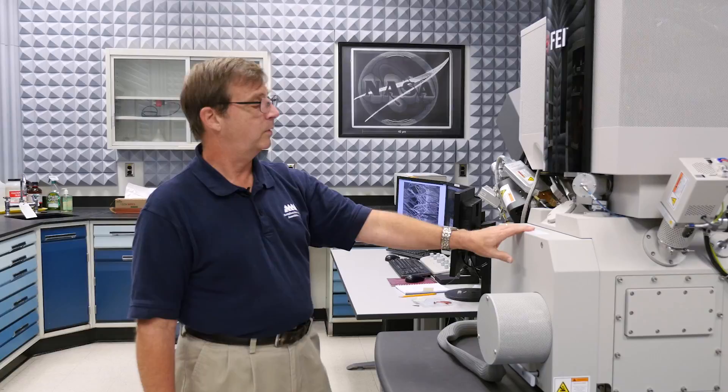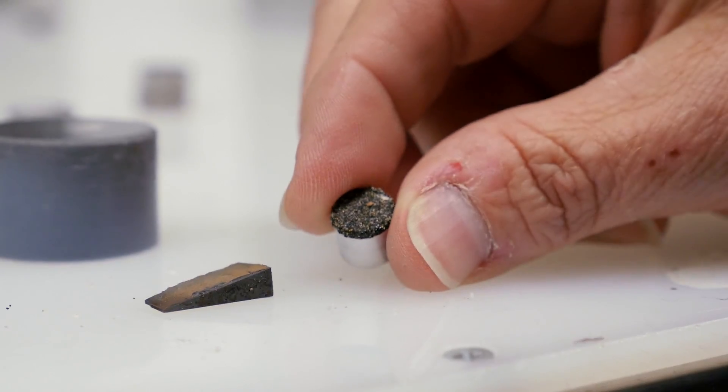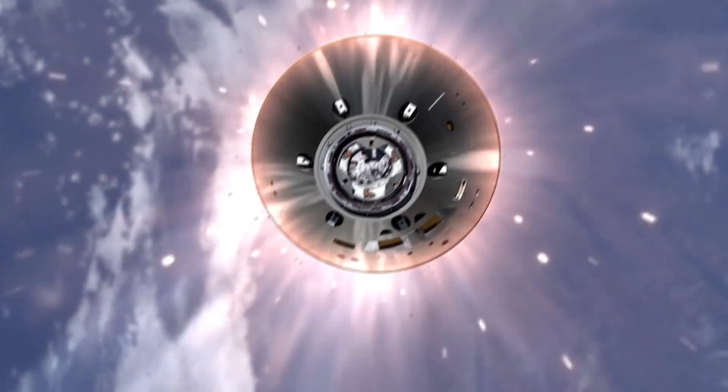Electrons come down, hit the sample, and determine why it fractured, how it fractured. It could be metal, plastic, ceramic - working on the shuttle, working on the Orion.